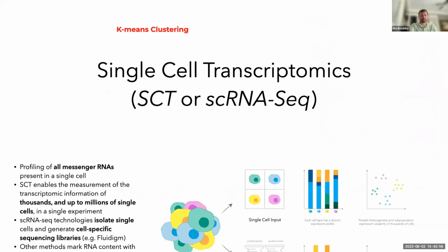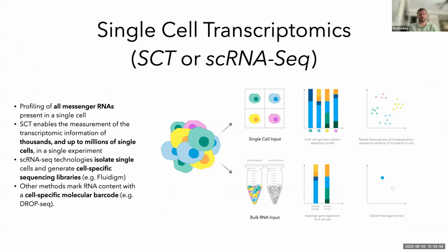So then we'll also talk about single-cell transcriptomics. An exciting technique becoming very, very popular. Many cores are now adopting 10x Genomics and other machines to be able to produce single-cell data. The question is, what can we do with it? And how do we do it so that we are in control of that analysis and we know how to ask biological questions and actually get answers to those?